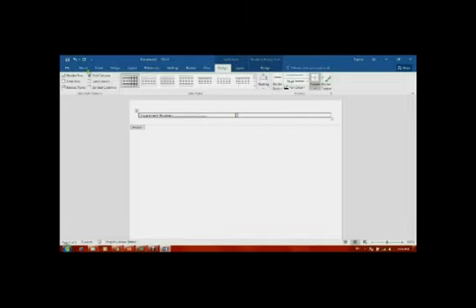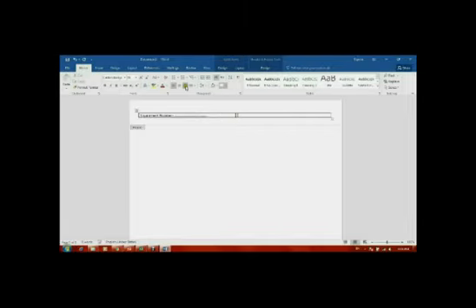To the upper left of the page, add experiment number. And to the upper right of the page, write continued from page number.